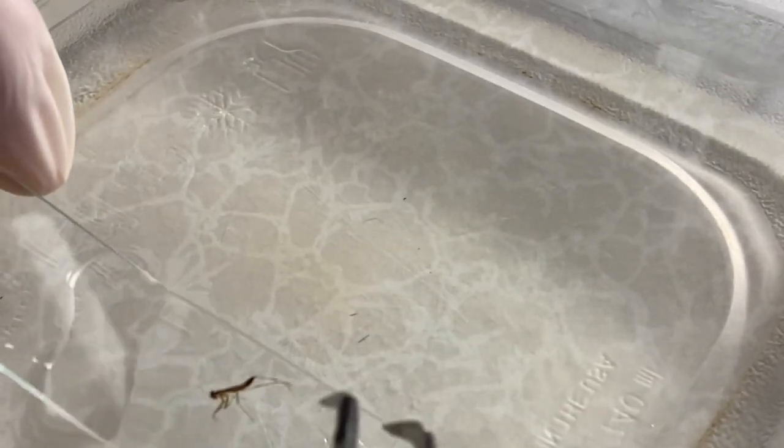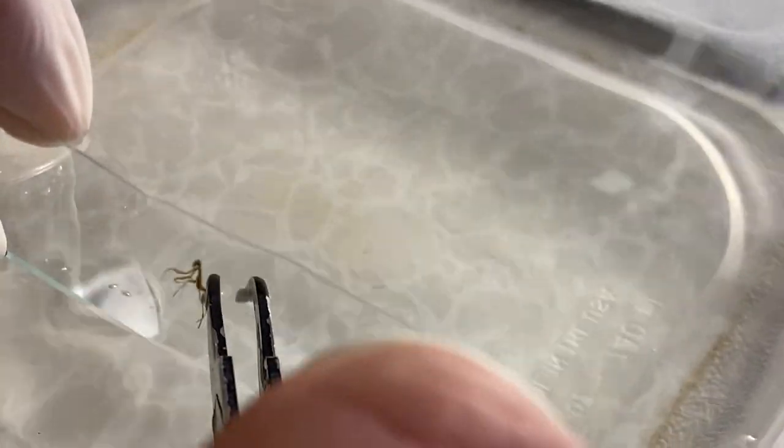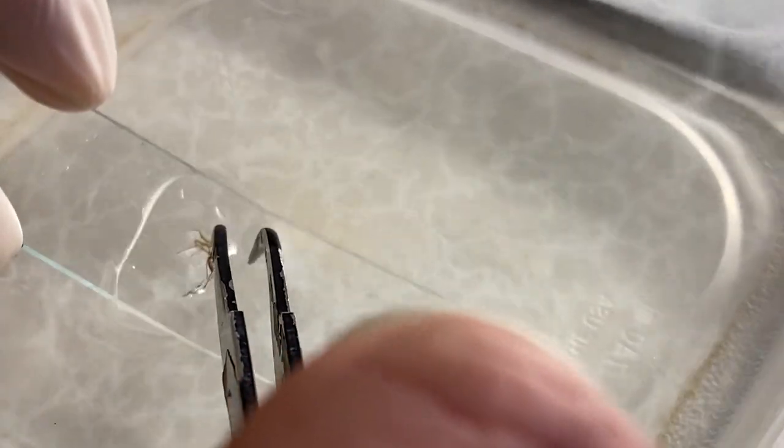You take a dish of water like I have here, and you take the insect and float it to the middle of the slide, like that.